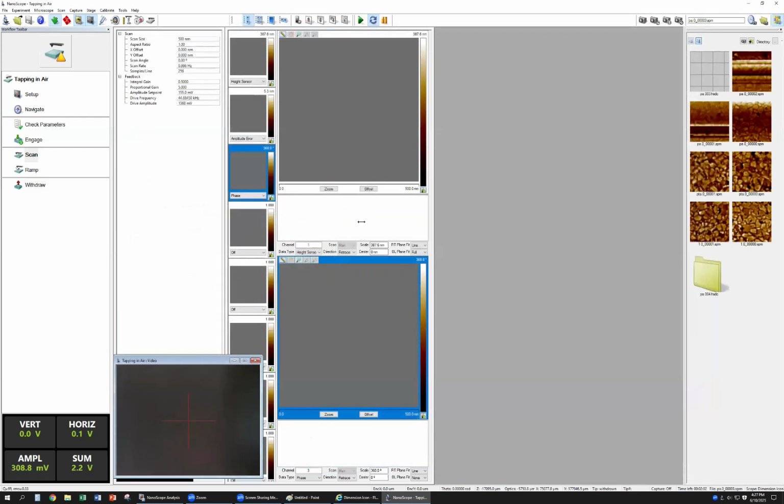Now we only have one parameter that should be calibrated. It's the R, right? It's the R. So the R is a little bit complex. So tomorrow I will show you how to calculate the R. So today I will show you how to get the force curve first, because the force curve is the basis for calculating the modulus, right? Okay.